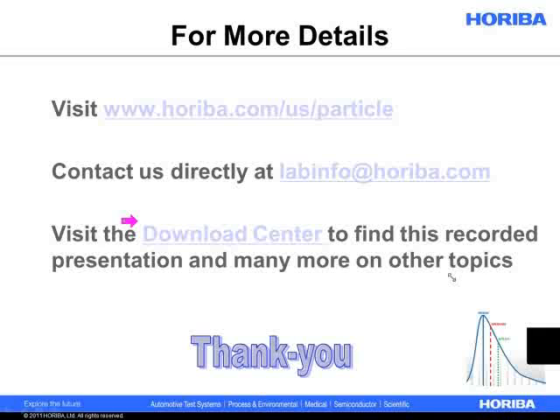By no means would I recommend doing a pressure study for 40 levels, because it's definitely going to be diminishing returns. But it's always good to test with 3 different pressures, something that's small, medium, and high, let's say.